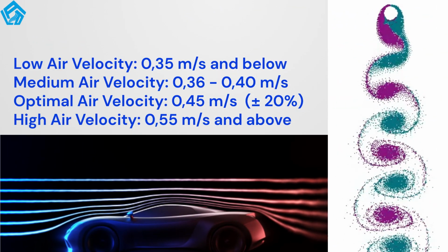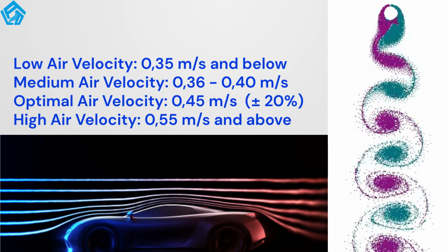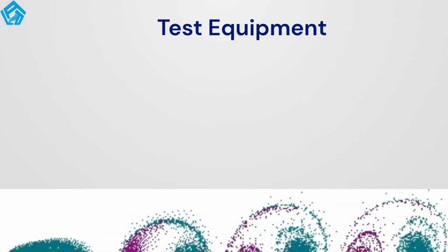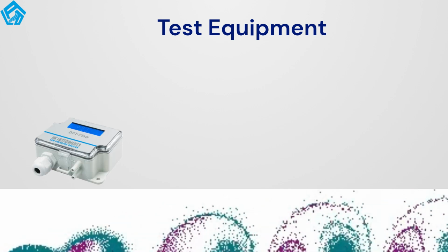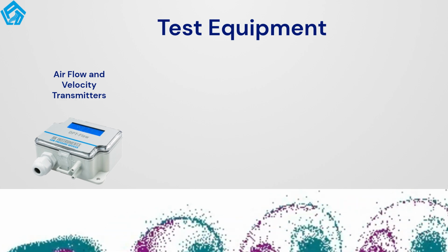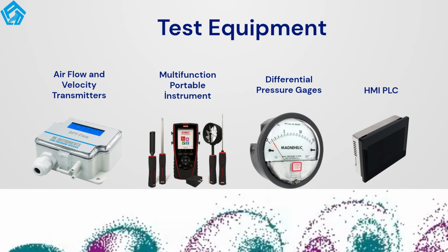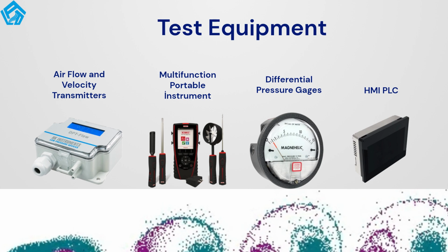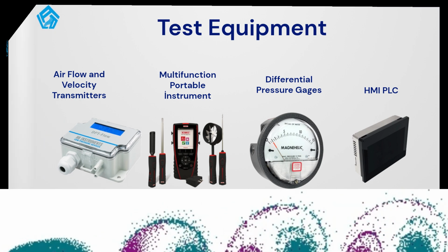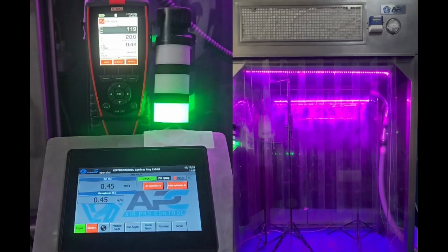Let's see the reactions at different air speeds with the smoke visualization we applied to the laminar flow unit. In this test, we will analyze the responses of optimal air velocity visualized with smoke.